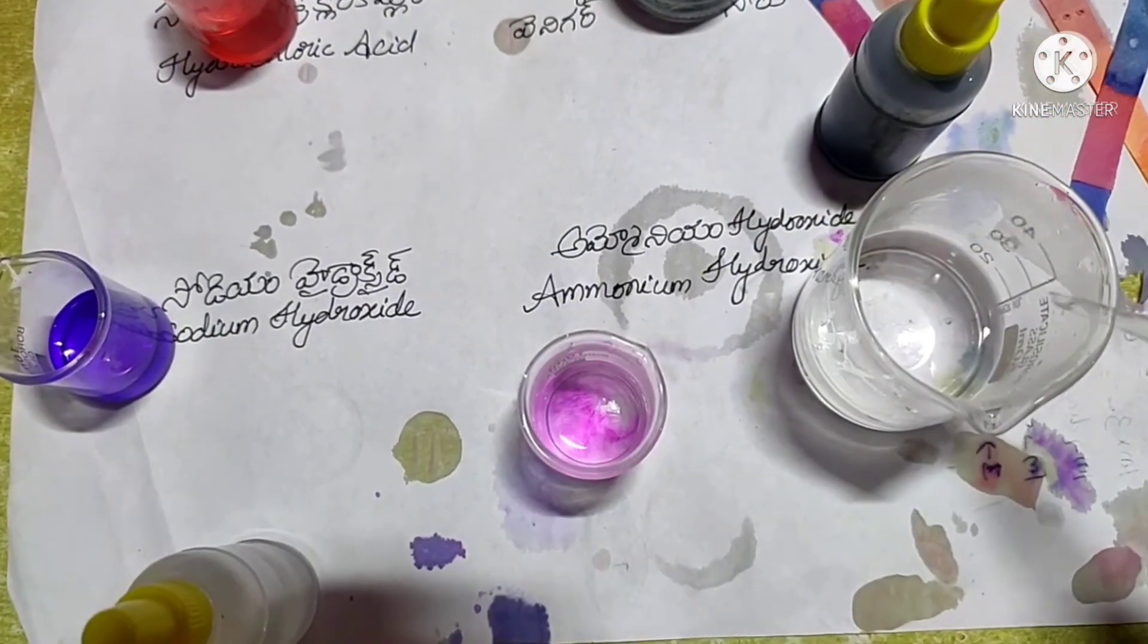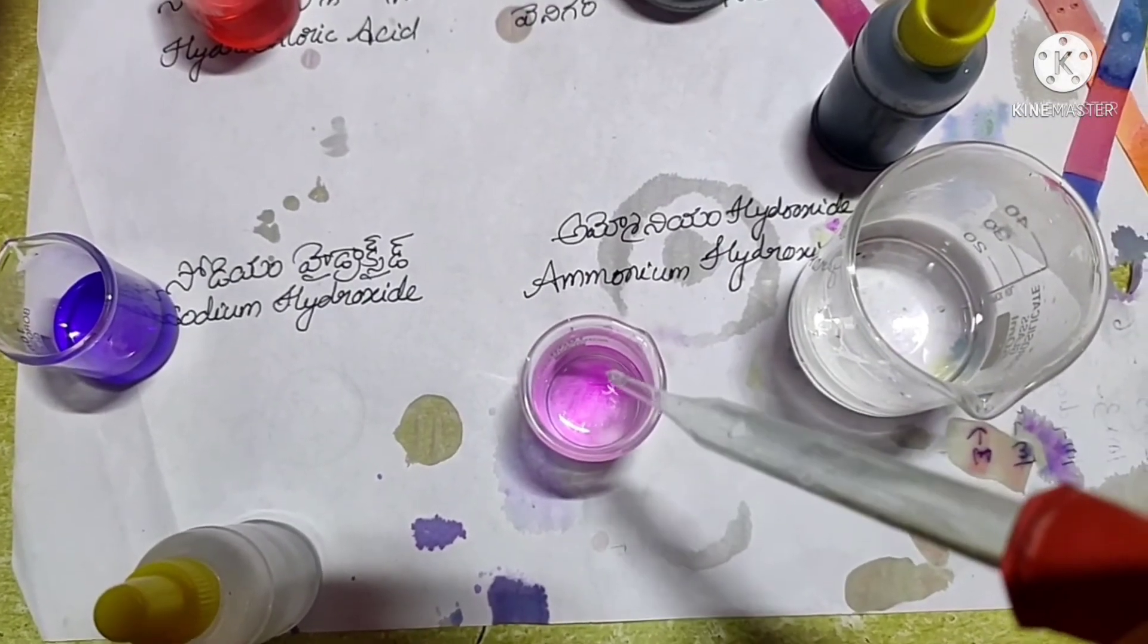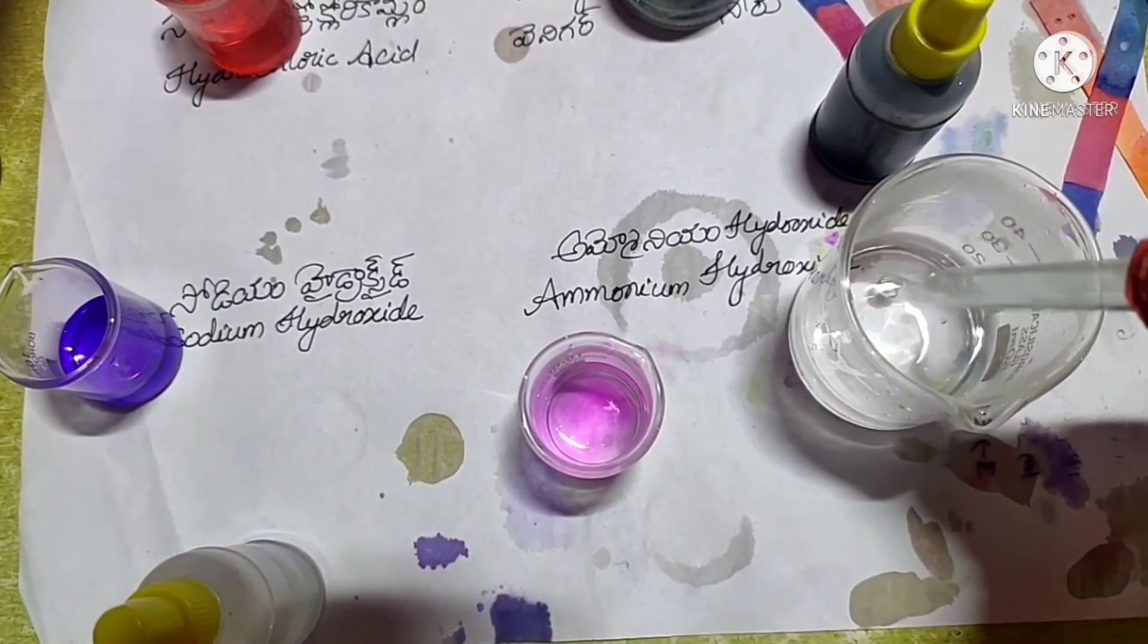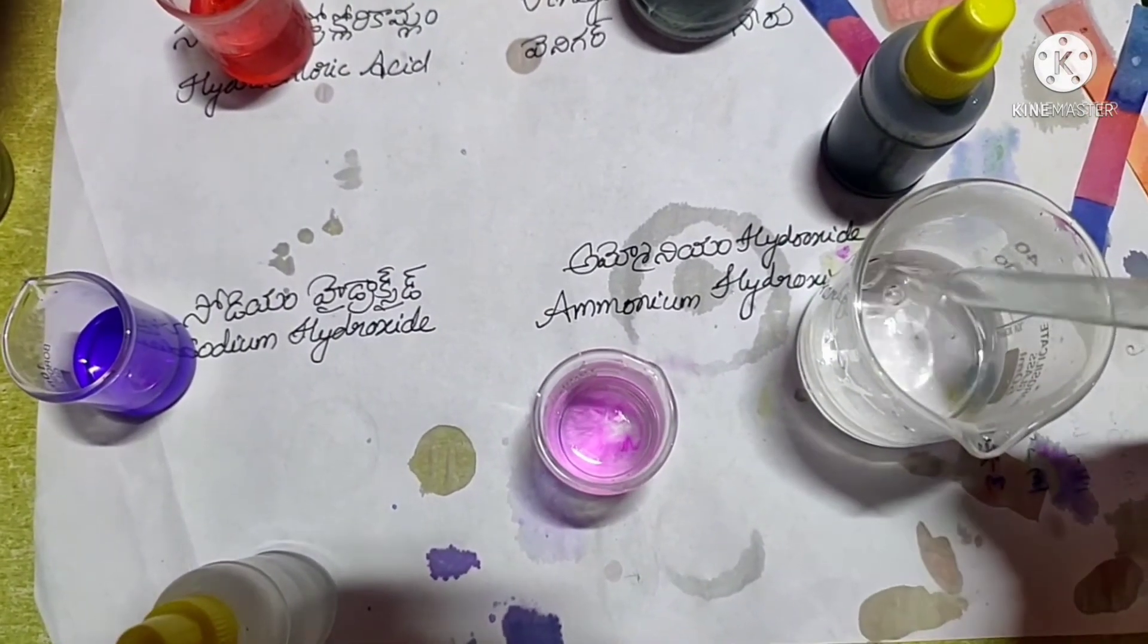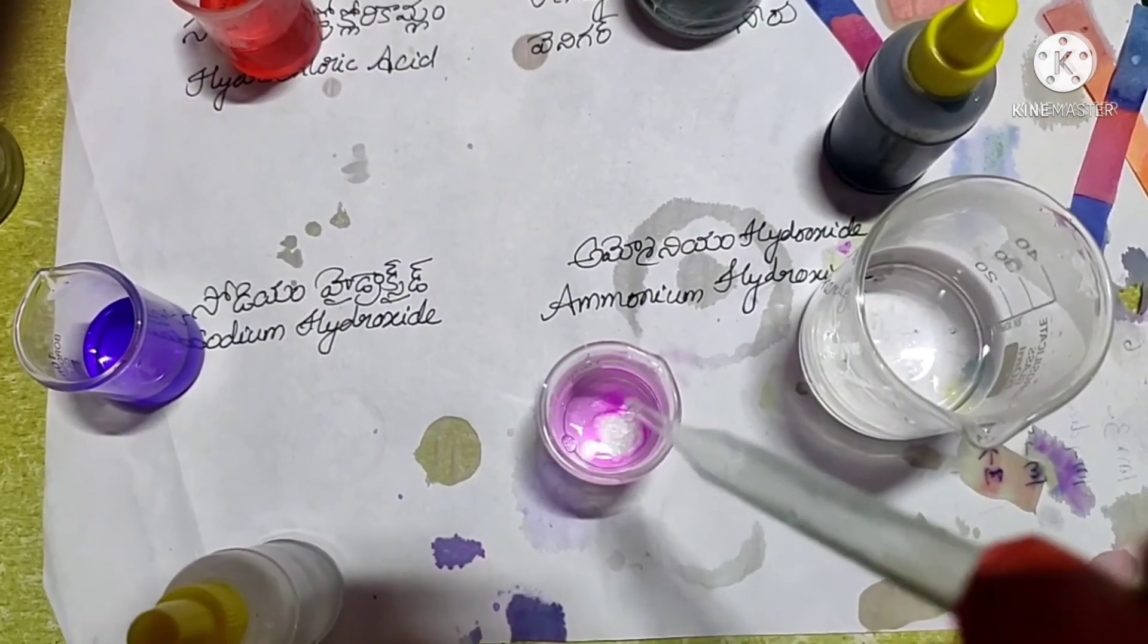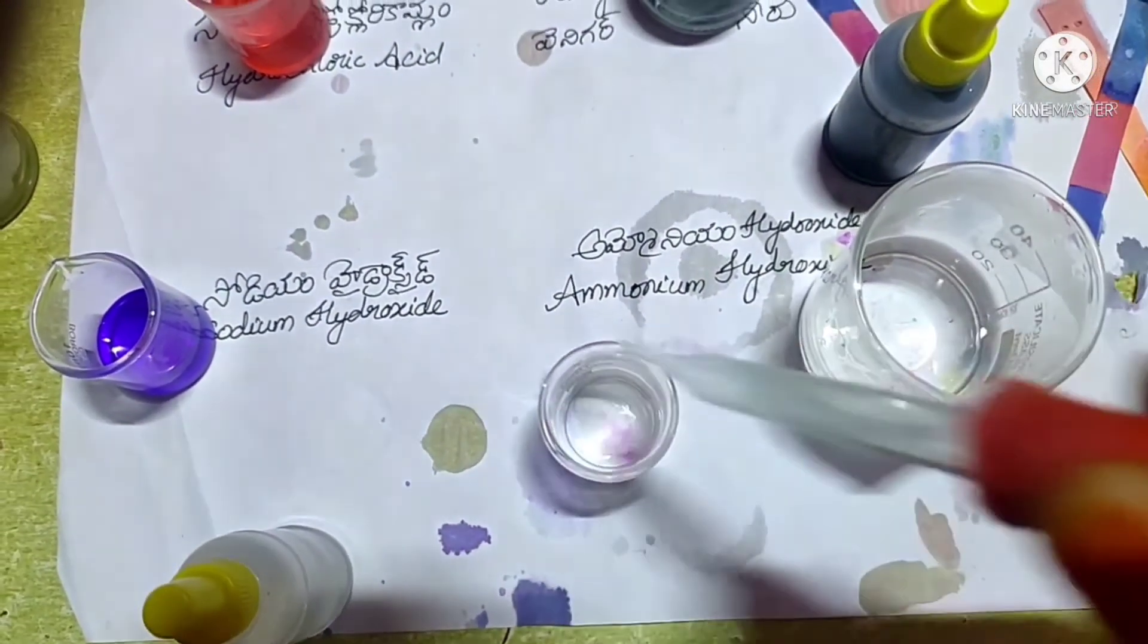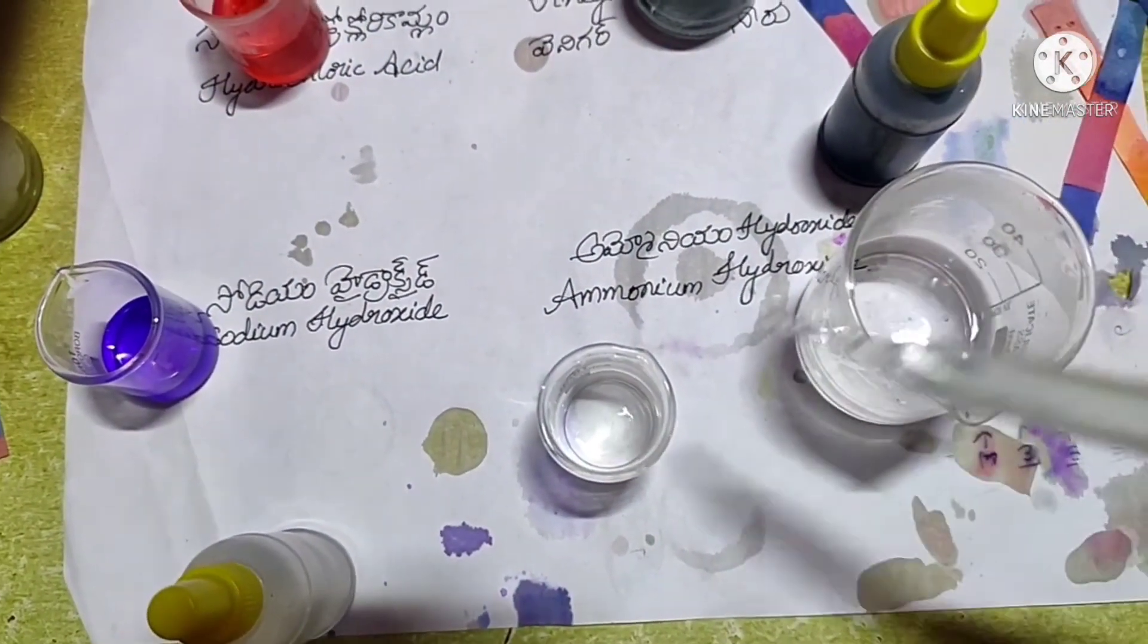Can you guess the substances formed in the flask? Those are salt, that is sodium chloride, and water, because acids react with bases to form salt and water.